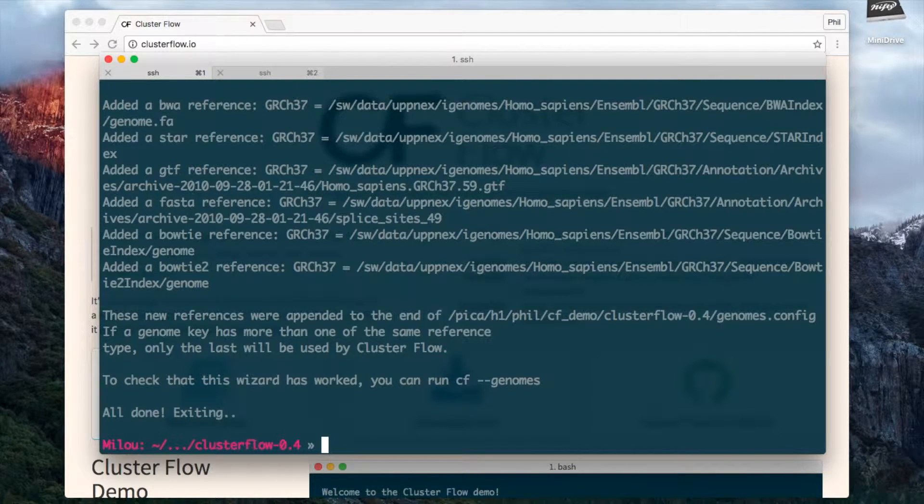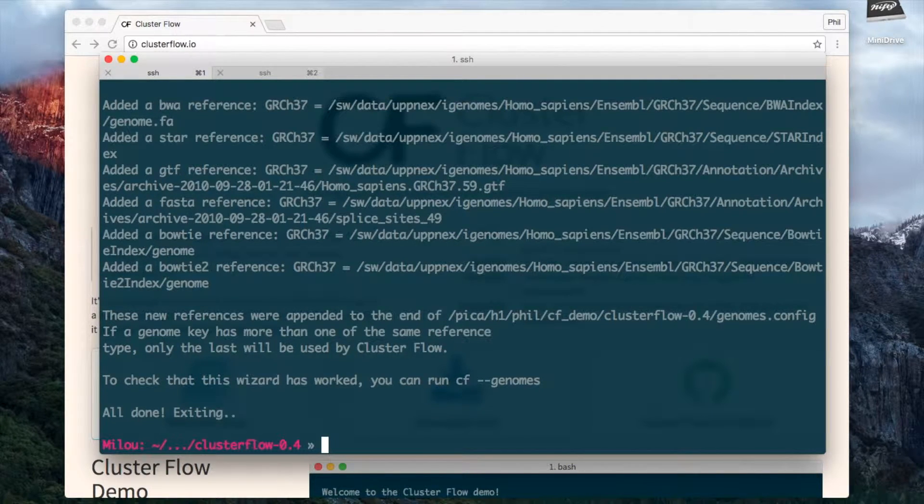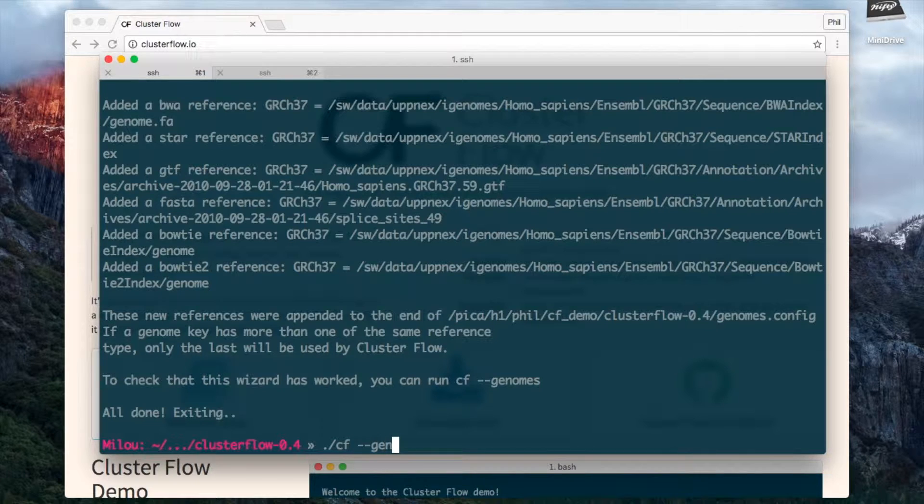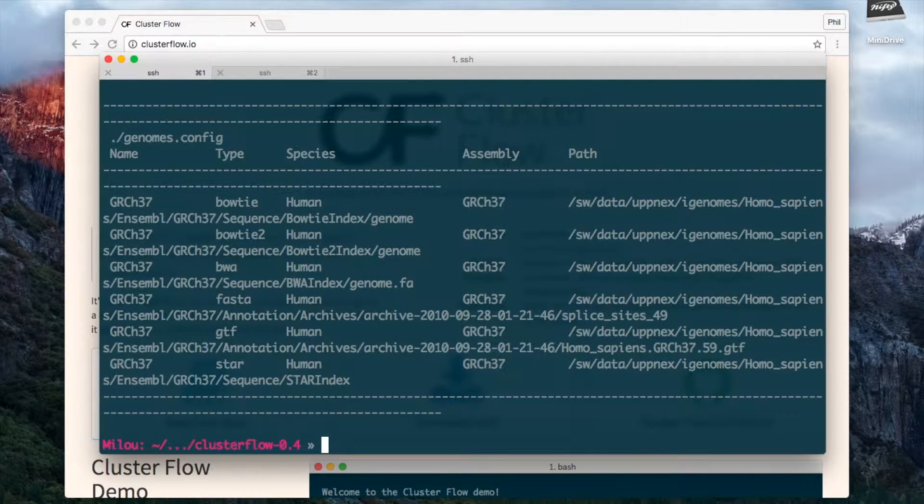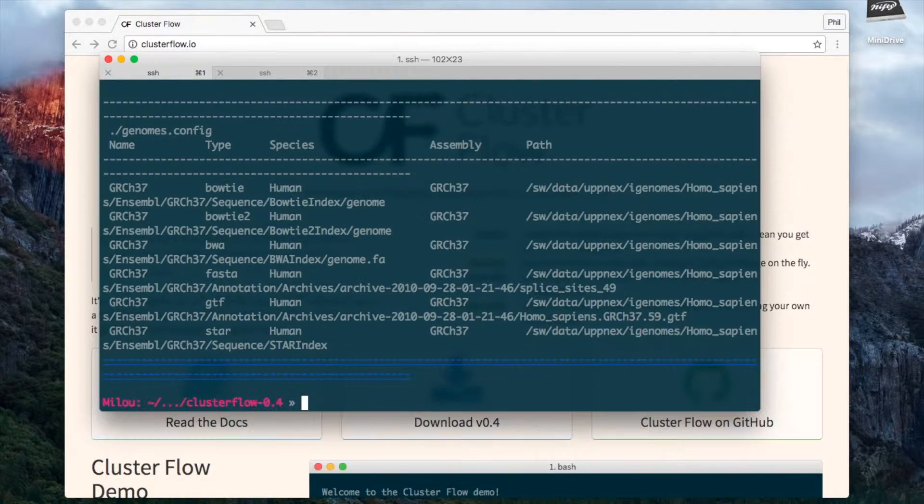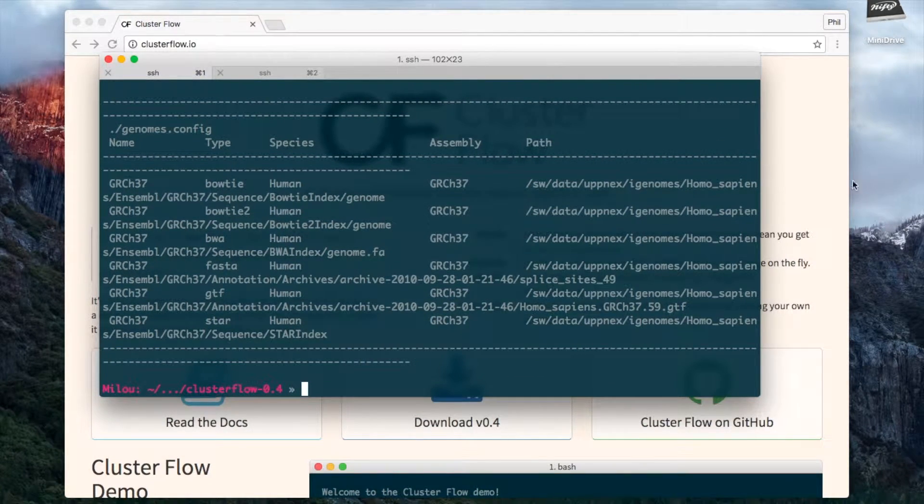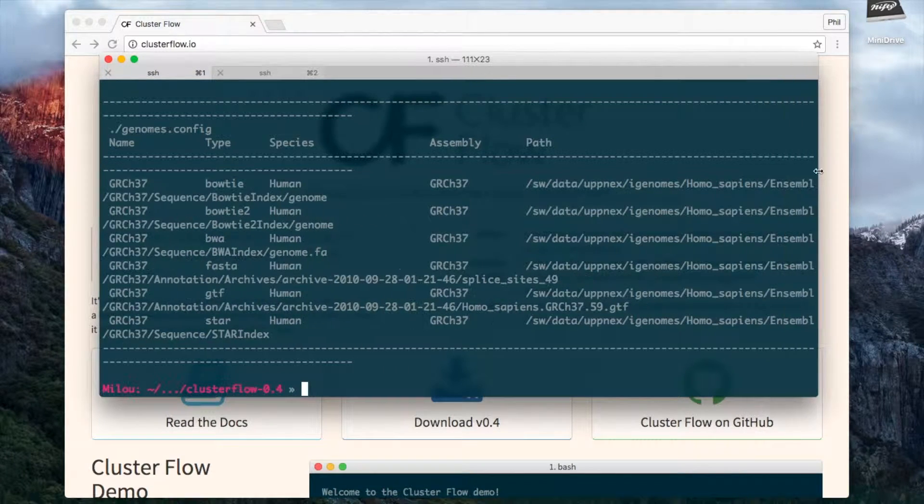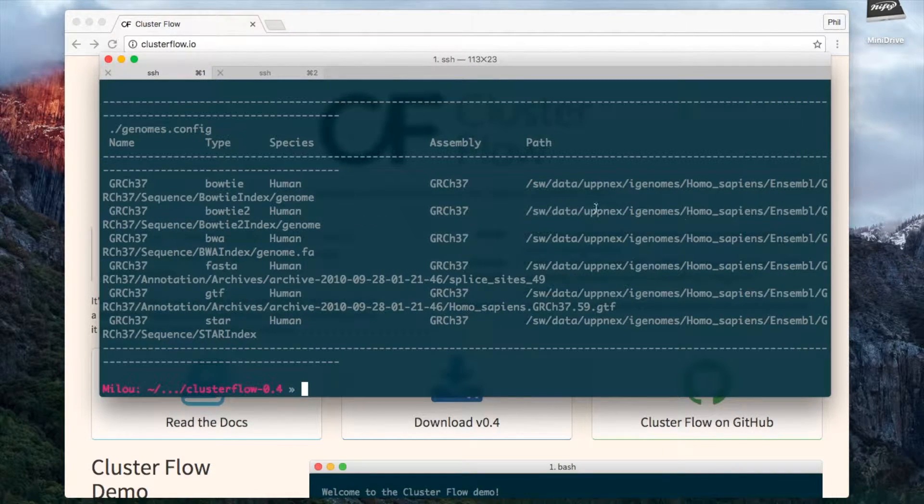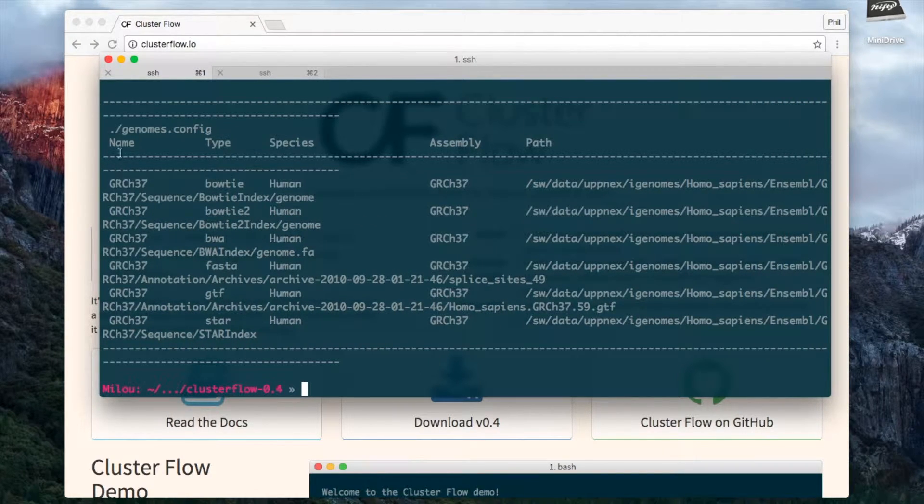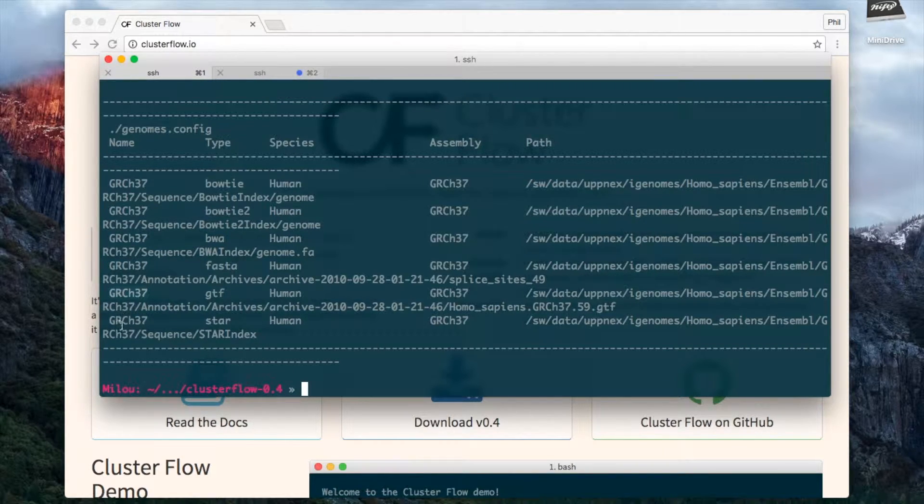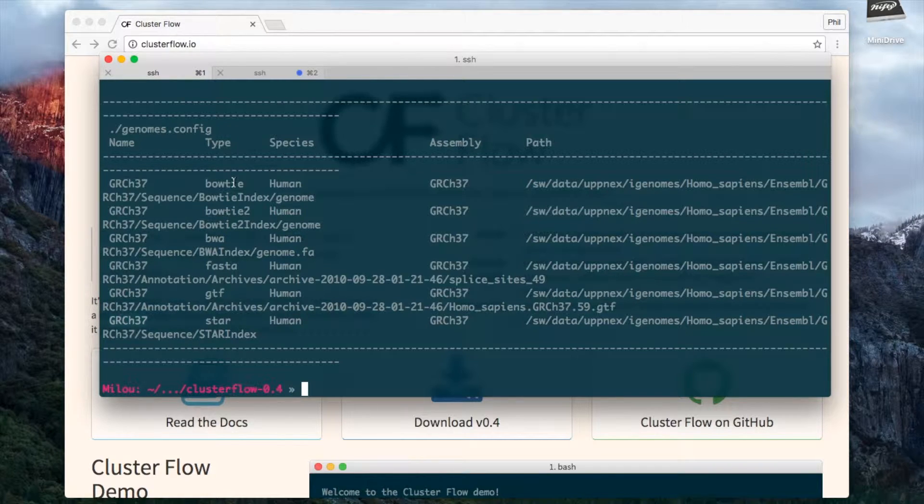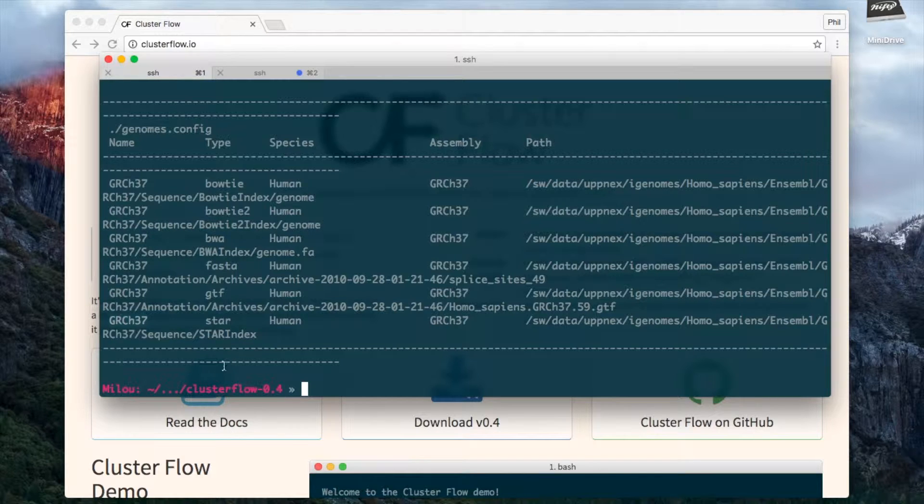Okay so that's finished and as it says I can now check its work by doing cf --genomes. Now we can see that Clusterflow knows about a range of different genomes here. These all have the same name, the same key, so I can specify these all just by doing --genome GRCh37 and if the pipeline includes modules for any of these different types then it will be able to use these different paths. So it's really easy to kick off Clusterflow as a result.